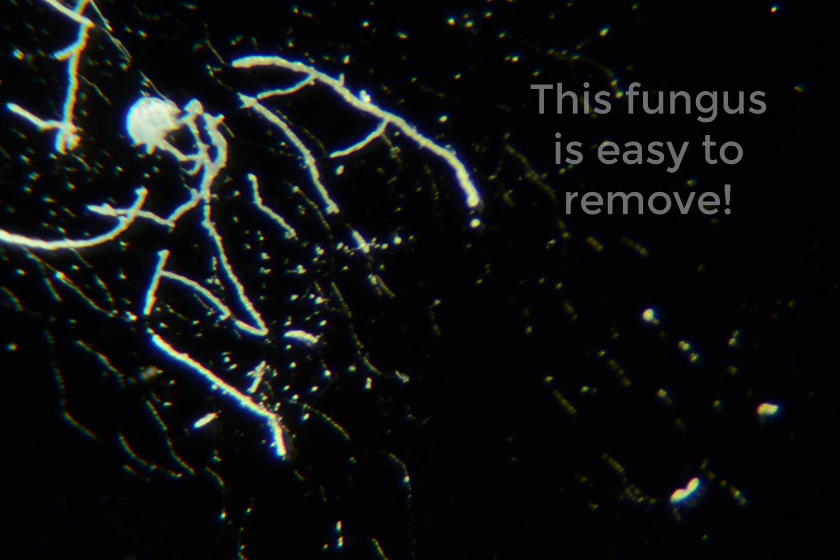This was the only fungus I found in that lens and objective. I guess the growth point should be that round thing in the center. The alien head or skull is gone, but it has a rather interesting pattern. I'm not an expert, so I cannot tell if this fungus is the same as the other one. It doesn't look similar under the microscope. Now you know how this type of fungus looks really close when it appears in a lens.